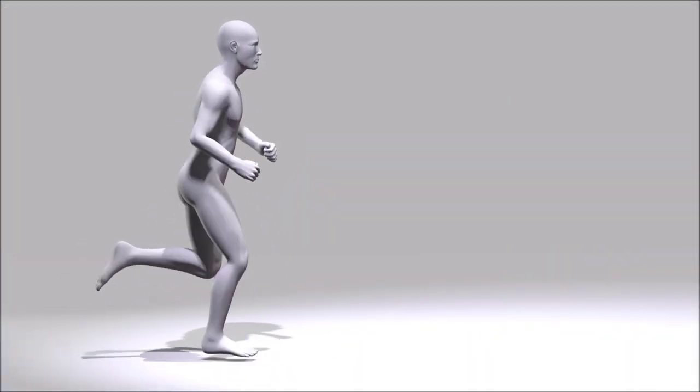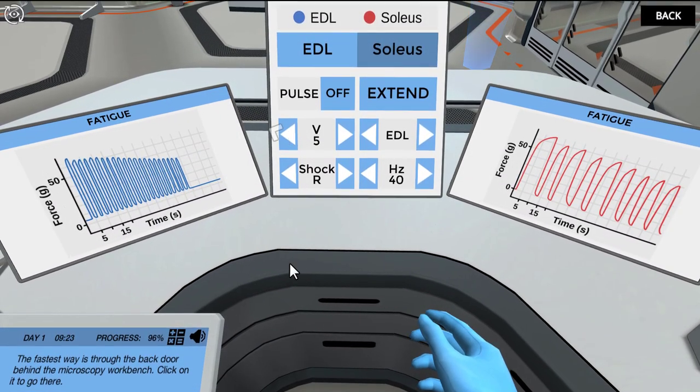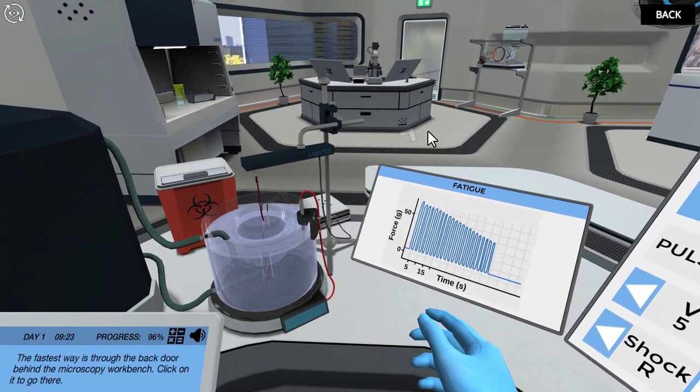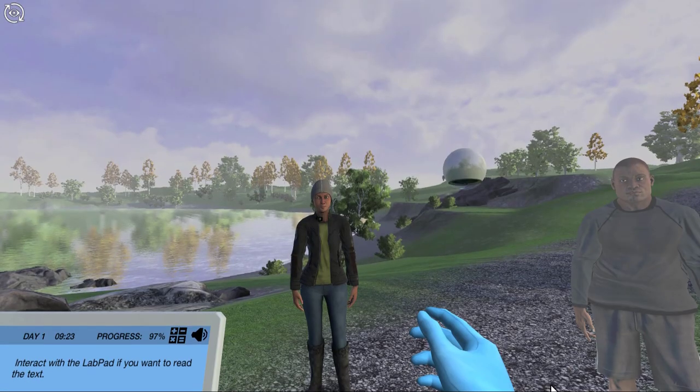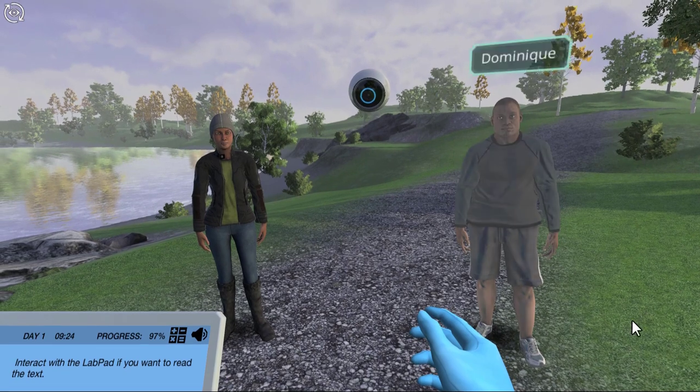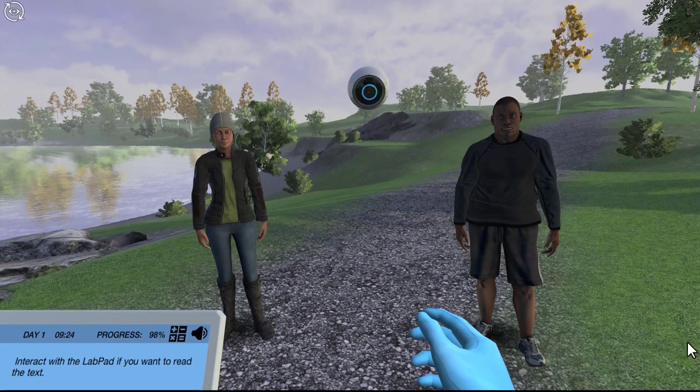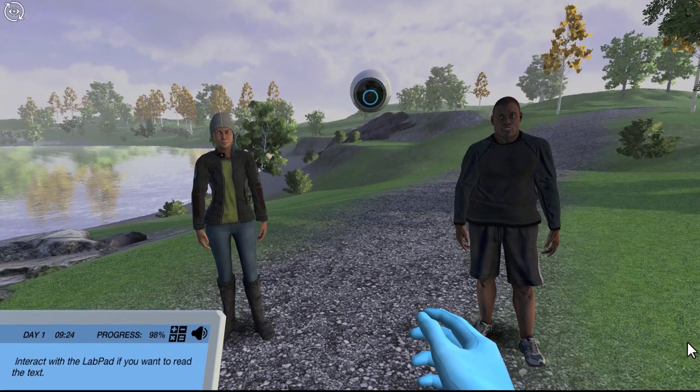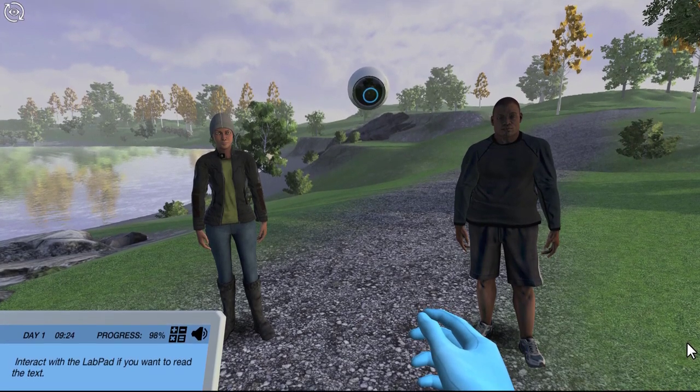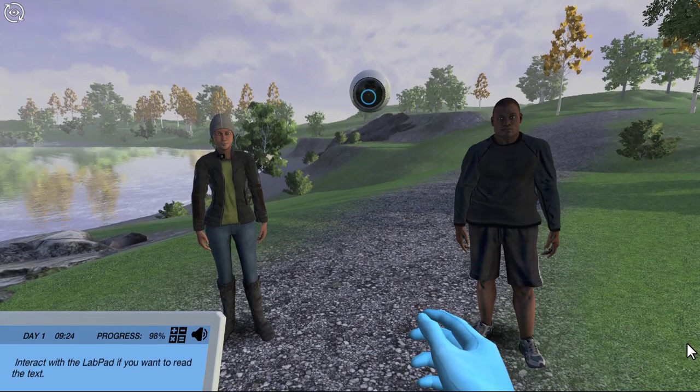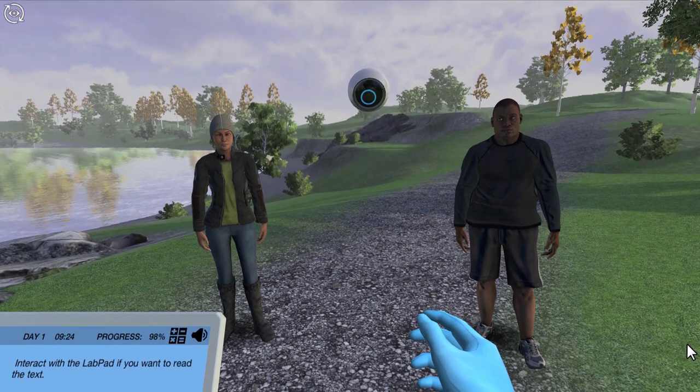I think you have everything you need to explain why walking and running use different muscles to your friends. The fastest way is through the back door behind the microscopy workbench. Click on it to go there. You're back! Awesome! I'm looking forward to hearing about the different types of muscles in our legs. So, what you are telling us is that when I am going on long slow jogs or walks, I am using my type 1 slow twitch fibers. And the soleus has more of this type. Interesting. And since I'm more of a sprinter, I use my type 2 fast twitch muscles more often but for shorter duration. This is like how the EDL relies mostly on anaerobic metabolism and tires faster than the soleus.